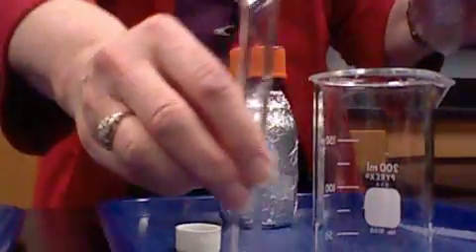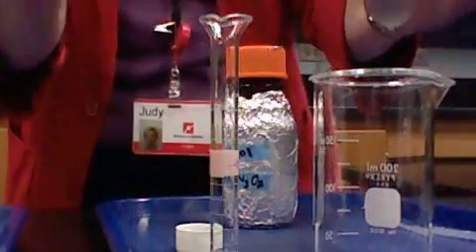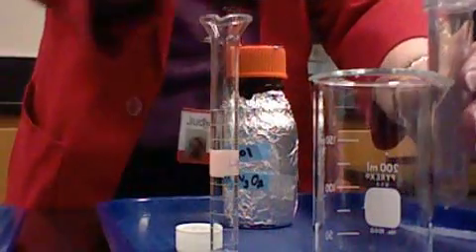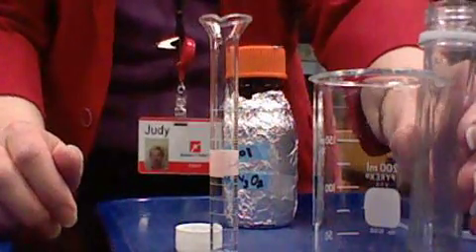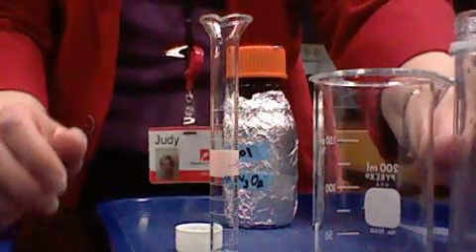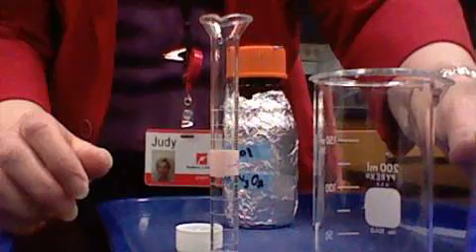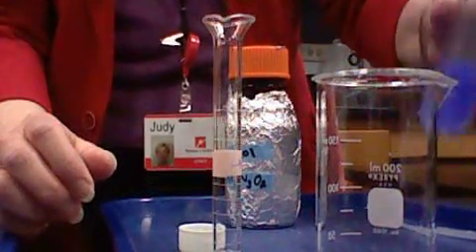It's your job now. So everybody has to watch what happens when you pour this one in here. You're going to pick this up and pour it in here. Pour all of it in. It's glowing. It's glowing. Oh, what happened? The chemical reaction caused it to glow.